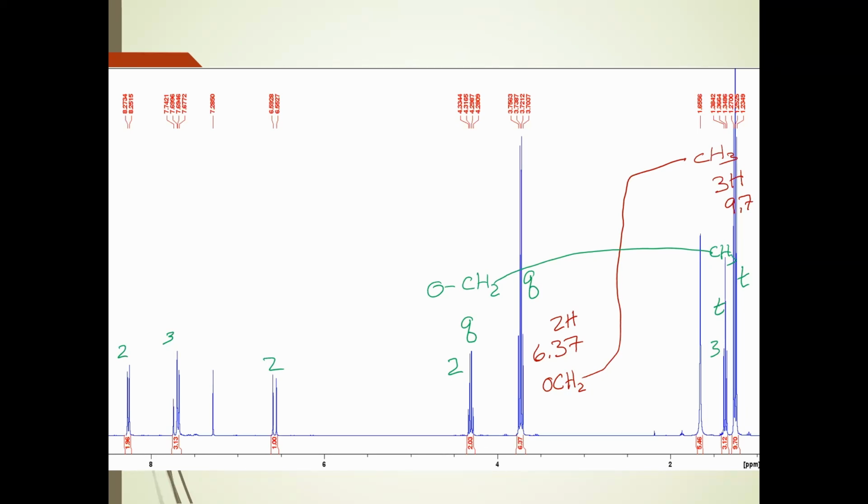And if you think about what you used in the reaction for your solvent, for your washes and stuff, the other peaks are probably from the solvent from your reaction. And so you may see that. In fact, for pretty much every spectrum, I think for this class, you guys just didn't leave it in the oven long enough, or the oven wasn't hot enough, or a combination of those two. You're going to have this issue.